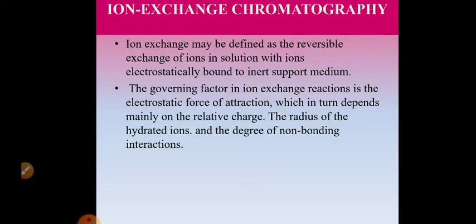Okay, let us start. Ion exchange chromatography. Ion exchange may be defined as reversible exchange of ions in solution with ions electrostatically bound to the inert support medium. What is ion exchange? Reversible exchange of ions present in the sample with ions that are electrostatically bound to the inert support medium.